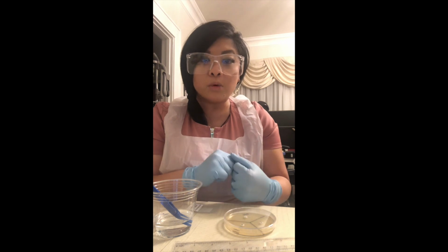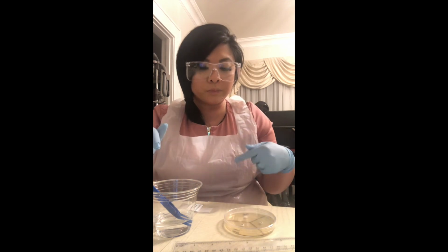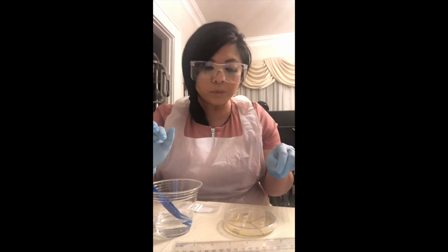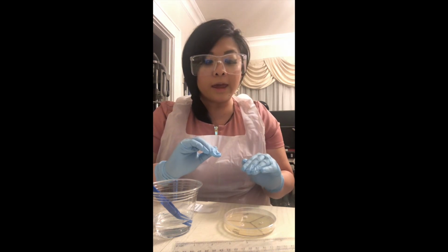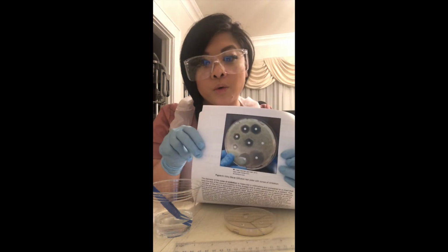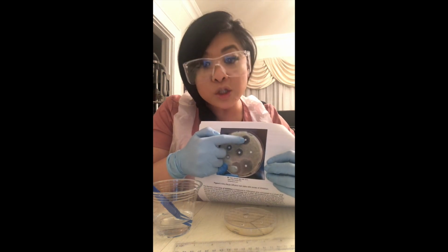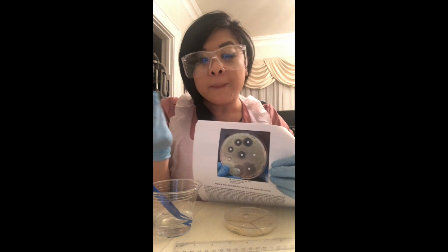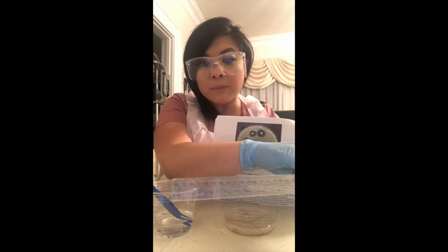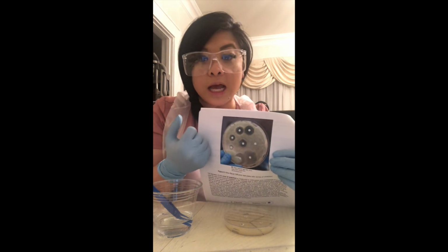So after 12 hours, I will check the diffusion plate for bacterial growth, which will appear as a white field, which will cover the agar, and then it will look somewhat like this photo. Here you can see the inhibition zone right over here, where there is no bacterial growth. And that's what I will be measuring with the ruler right over here from my lab kit. And that will be the measuring of the inhibition zone and the resistance to the antibiotic.